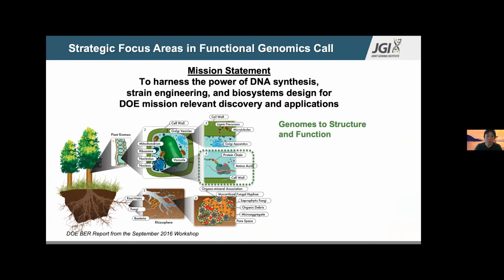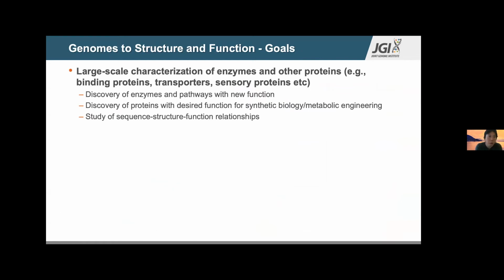Okay, my name is Yasuo Yoshikuni, head of the DNA synthesis science program at the JGI. The second session of this webinar will focus on genomes to structure and function, which is one of our strategic focus areas in the functional genomics call. People who are interested in this genome to structure function category proposal are usually interested in large-scale characterization of enzymes and other proteins, including binding proteins, transporters, and sensor proteins. Typically, they're interested in discovery of enzymes and pathways with new functions, discovery of proteins with desired function for synthetic biology, metabolic engineering, and study of sequence, structure, function relationships.